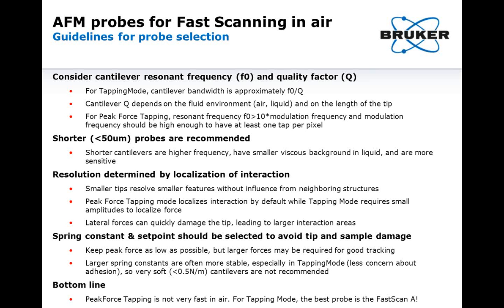For PeakForce tapping, the resonant frequency and the modulation frequency should be high enough to have at least 1 tap per pixel. Shorter probes are always recommended, as shorter levers, as we've seen many times before, are higher frequency and are more sensitive. And the resolution is determined by the sharpness of the probe. Once again, the microscope maker's rule.